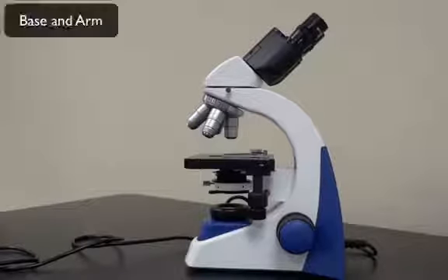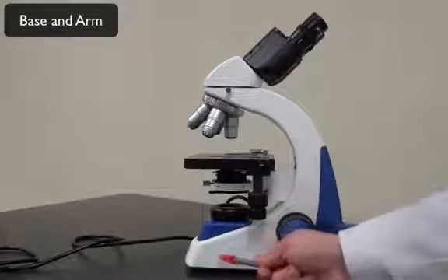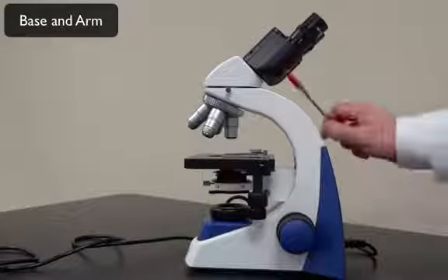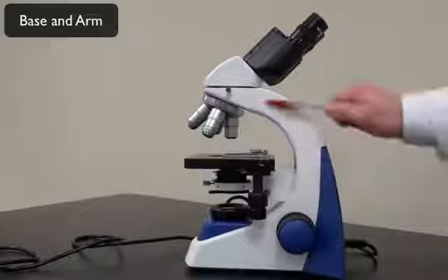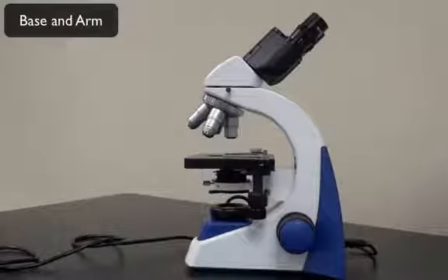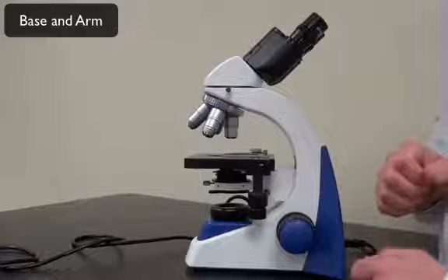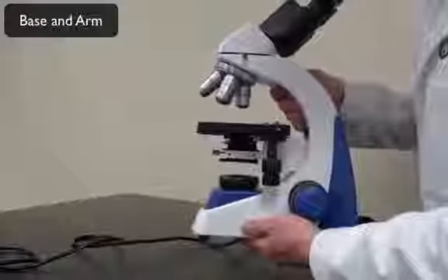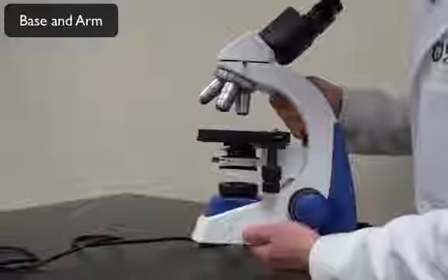So first off, what you notice with the microscope is that it has this large base and then it comes up over here. This is the arm of the microscope right here, and this is considered the base. Now this is the stability point of the microscope, and anytime you move the microscope, you're going to lift it up by the arm and the base. You're always going to hold it and move it this way.